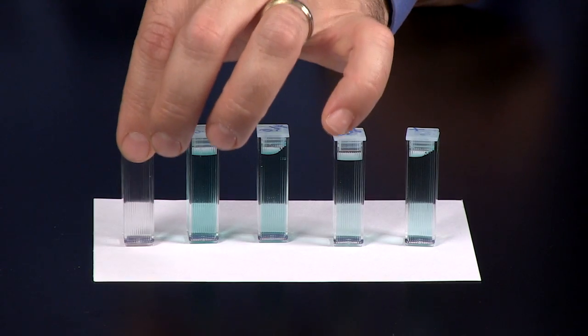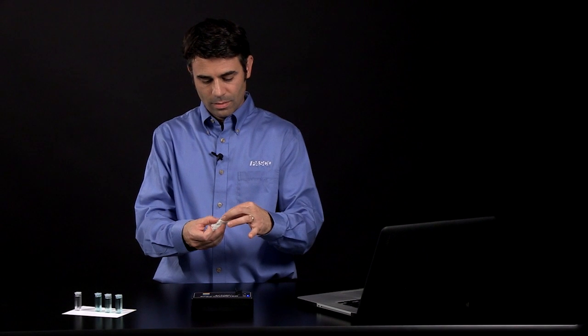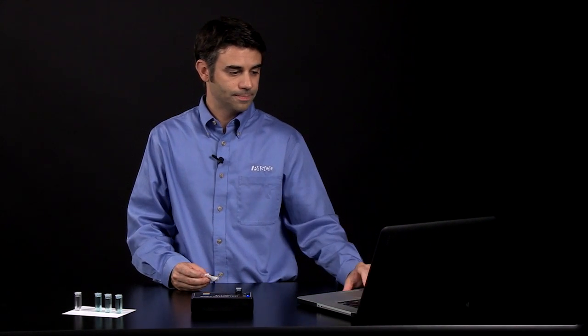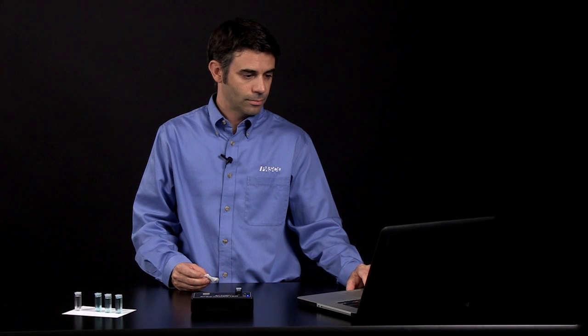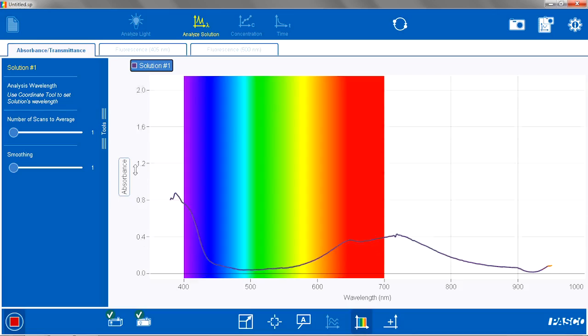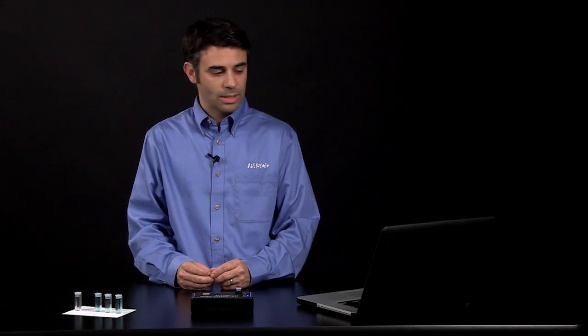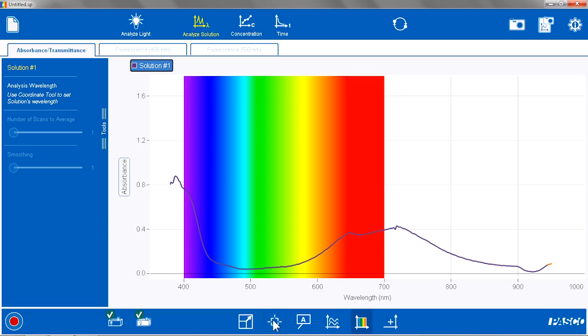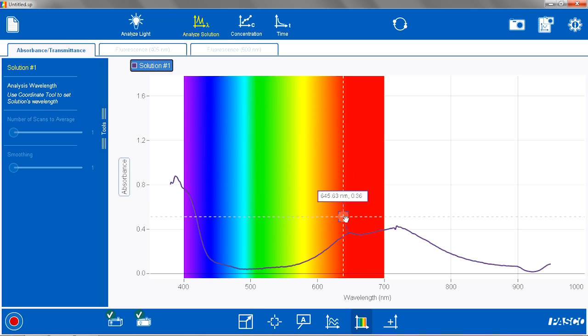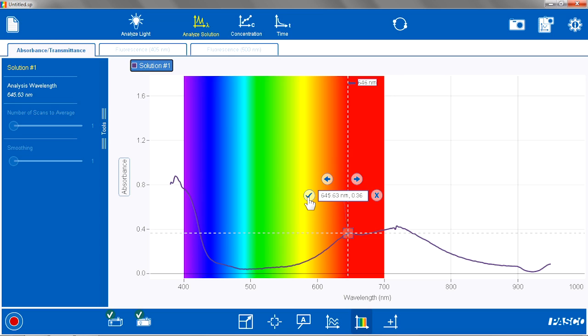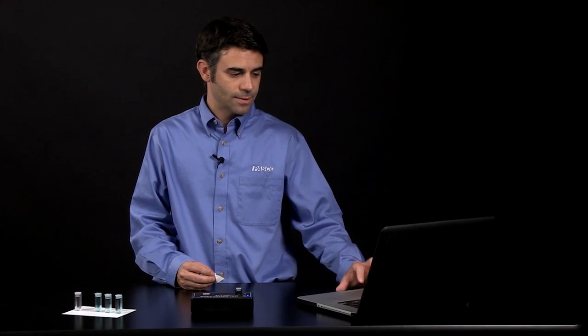Now I am going to take one of my standards, clean the sides, put it into the spectrometer, and I am going to see the absorbance spectra. I am going to stop recording. I am going to set the wavelength for study using my coordinates tool. I am going to drag that over to the region where I want to do my study, in this case, a red-orange region of the spectra with a relatively high absorbance. It is around 656 nanometers in this case.